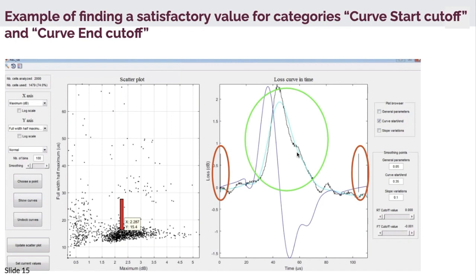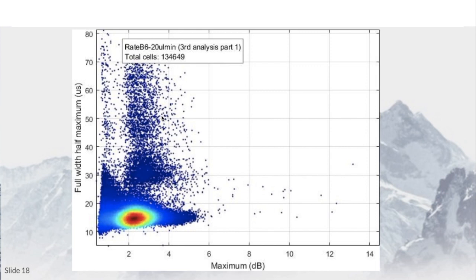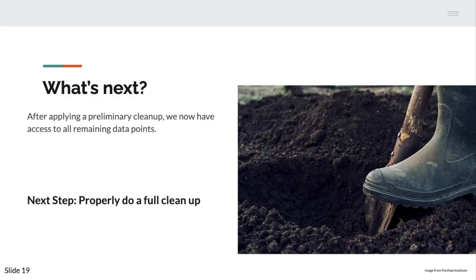So what I would do is adjust the values of each parameter and move them inwards to isolate the parabola. And by doing so, we would eliminate all this irrelevant part. And so this would look like a well-tuned parameter. And so after parameter tuning, we have this scatter plot that remains. So what do we do with that? The next thing would be the full cleaning process.